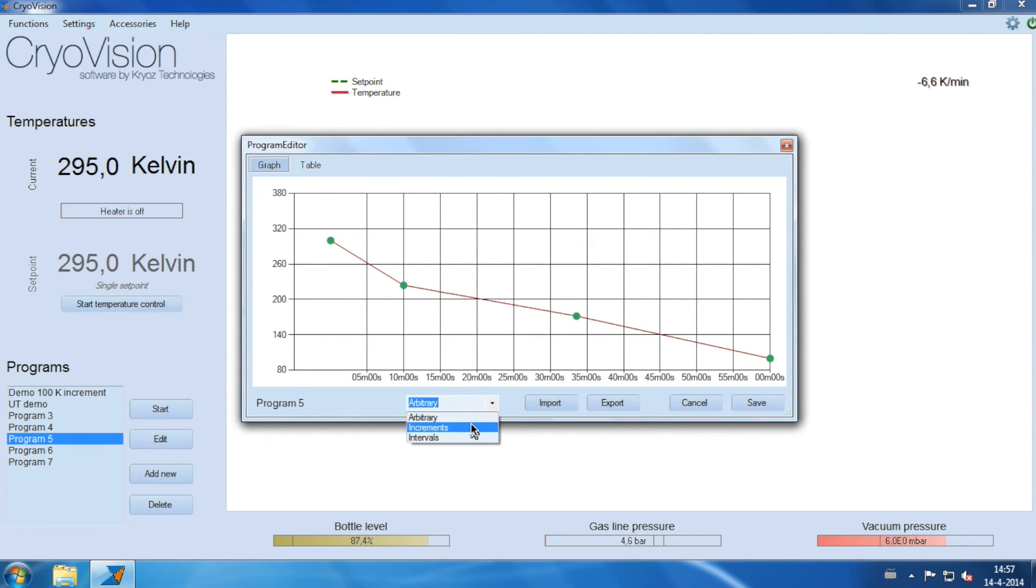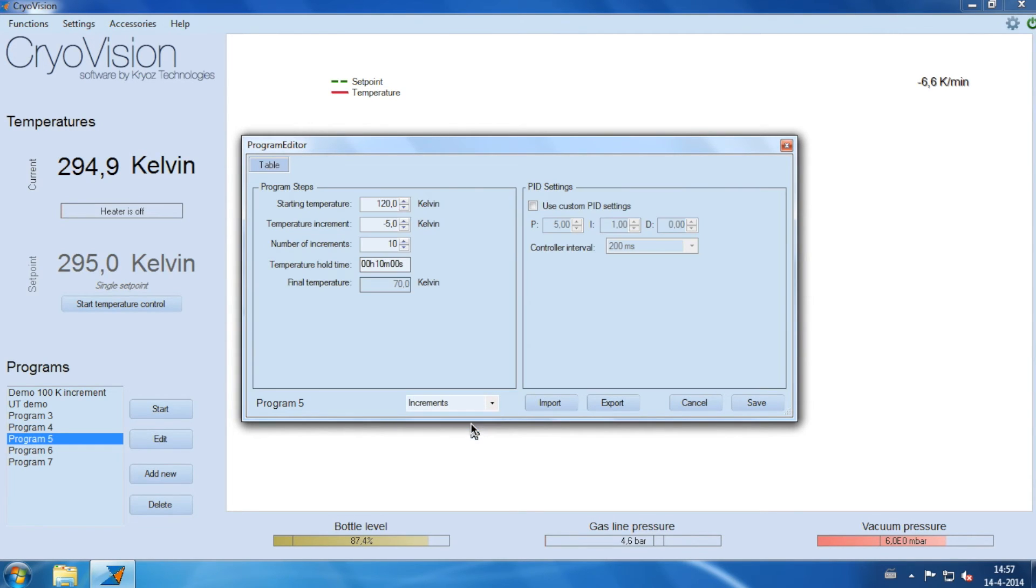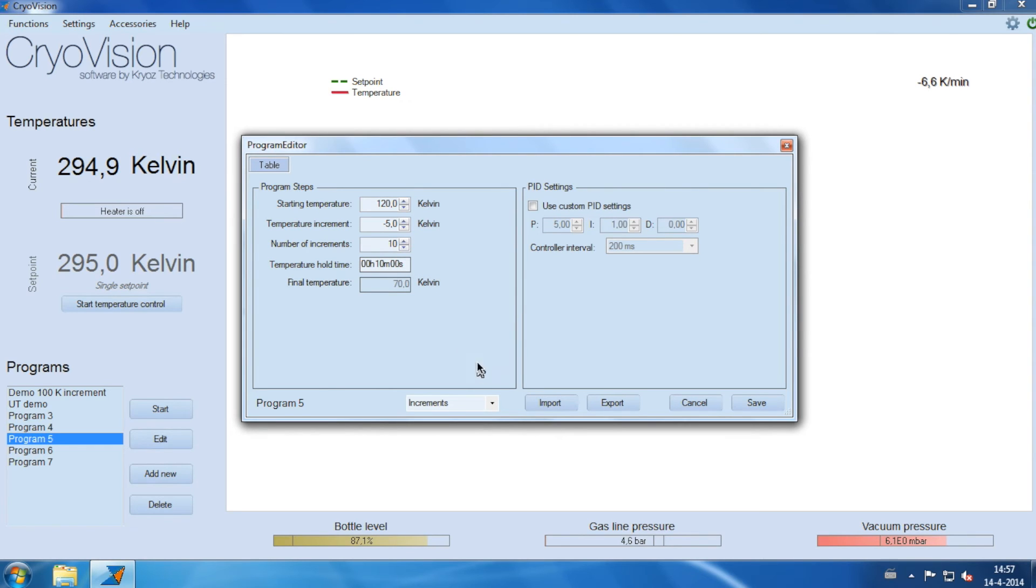Using increment, you can define the starting temperature, the value of the increments, the number of increments, and the time to stay at a certain temperature.